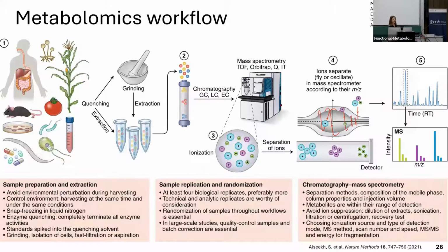Cool. Then this is a really nice paper and figure, especially by LC, that shows the whole metabolomics workflow, from very diverse samples to quenching, extracting, separating, analyzing, and then acquiring all the data. And really, they summarize here everything that we said today and even more that Martin and Daniel will talk about.